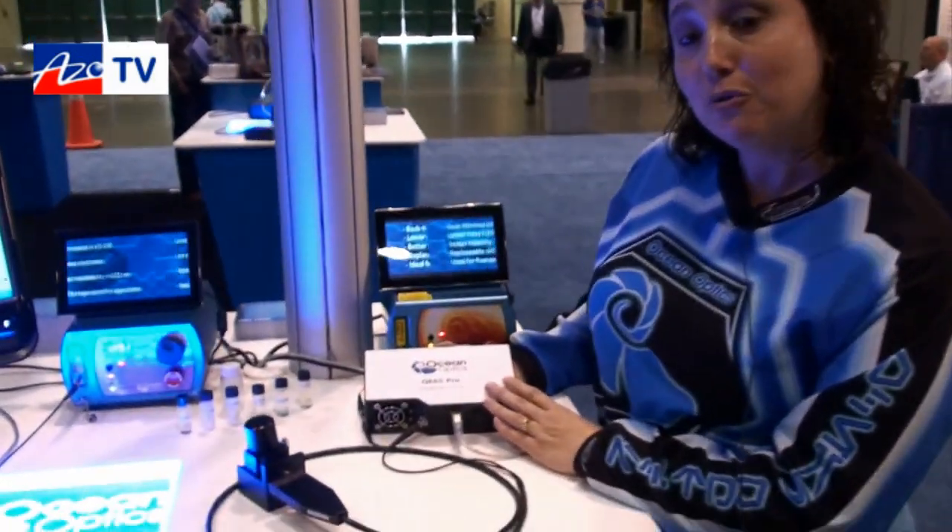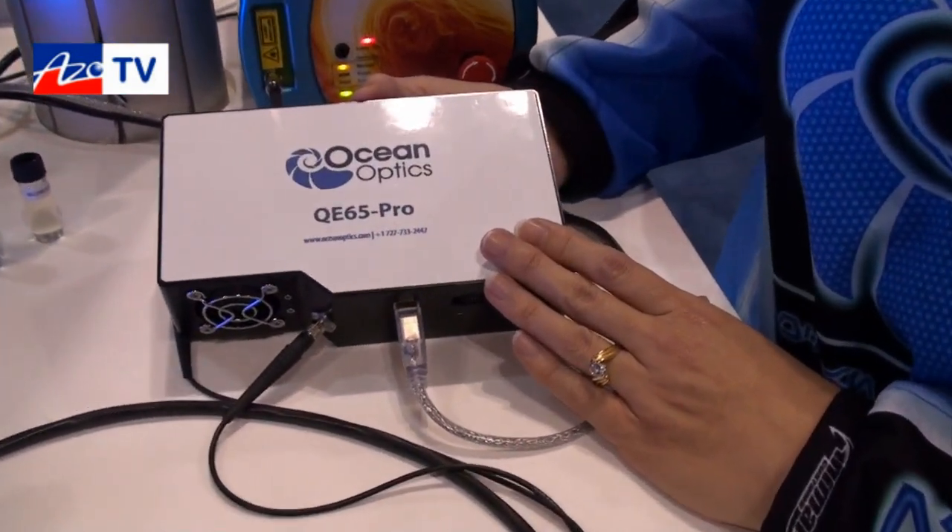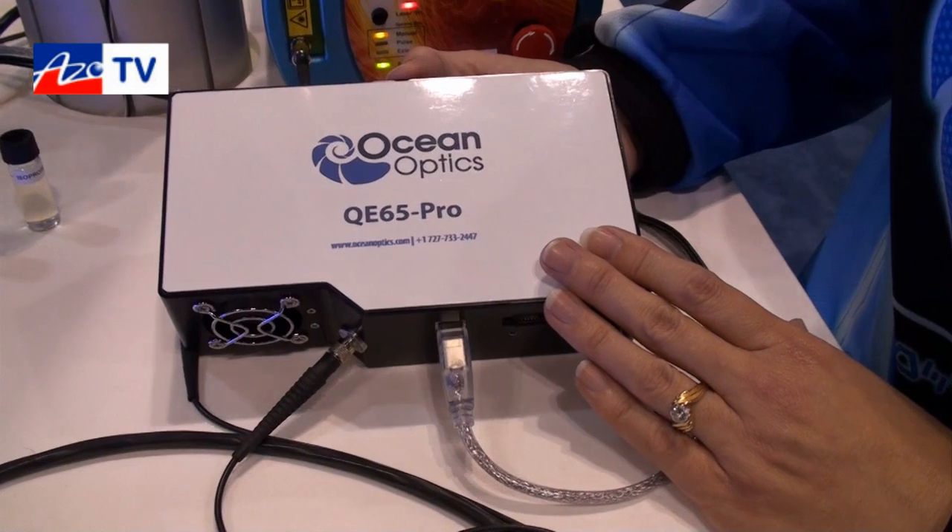This is Cameron Chai from azom.com bringing another episode of AzoTV, and today we're speaking to Yvette Matley from Ocean Optics, and she's going to tell us about their QE65 Pro. Thank you Cameron. I'm very excited to have the newest addition to our QE65000 product line — this is our next generation QE65 Pro.